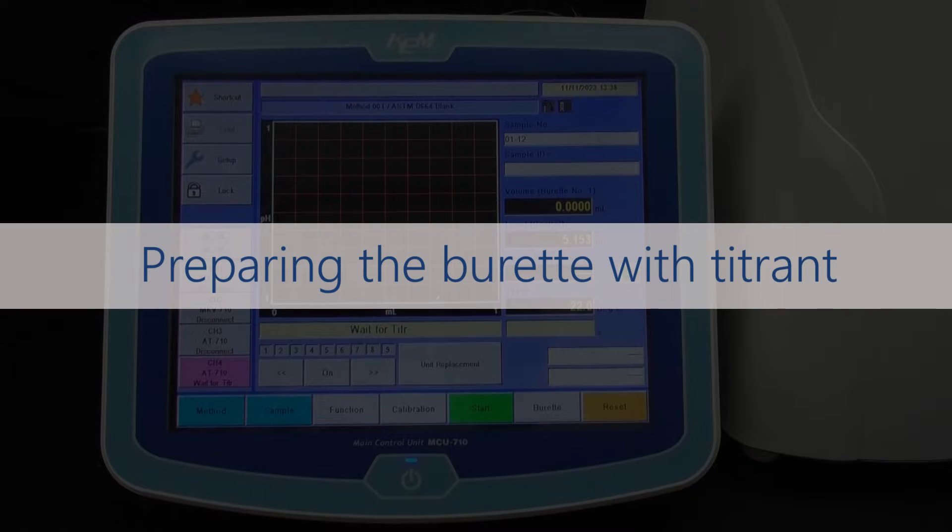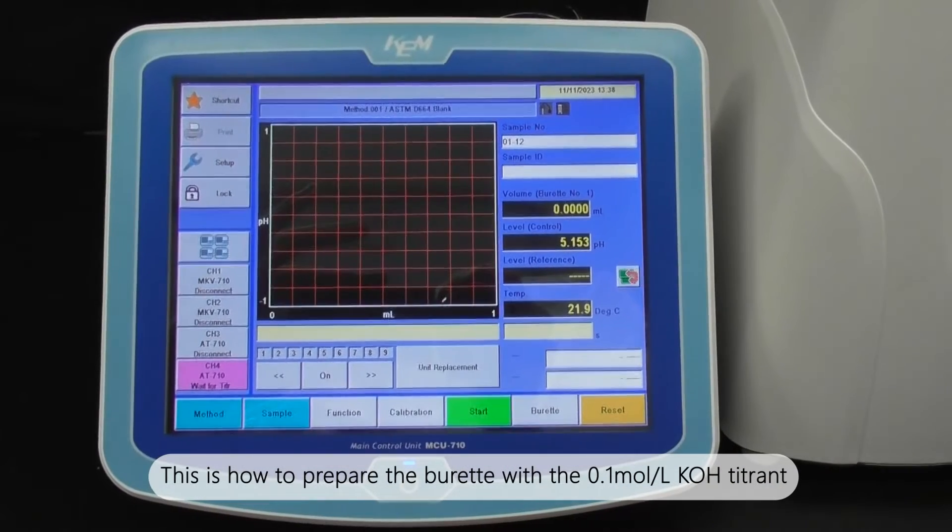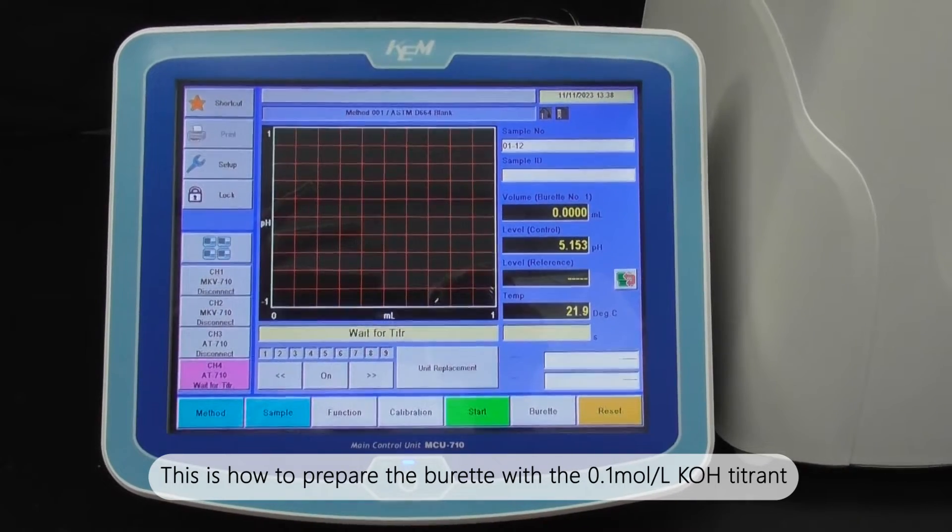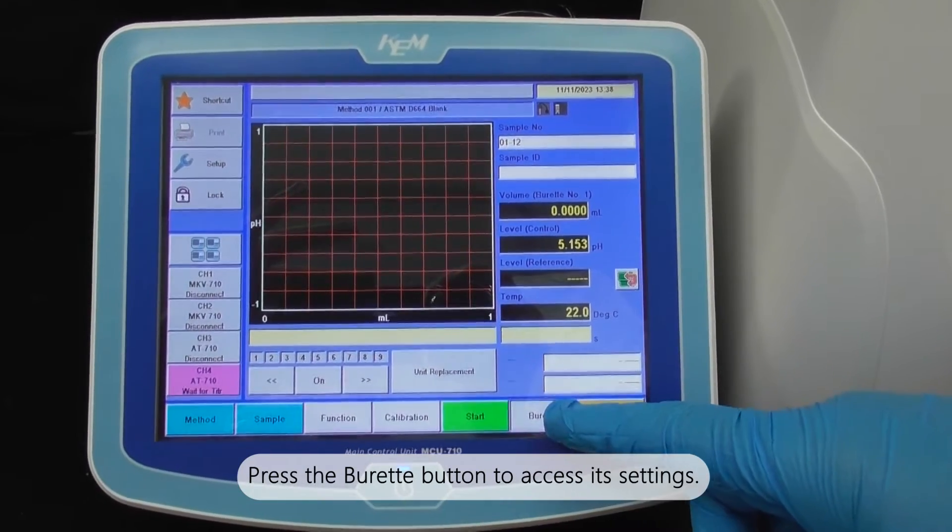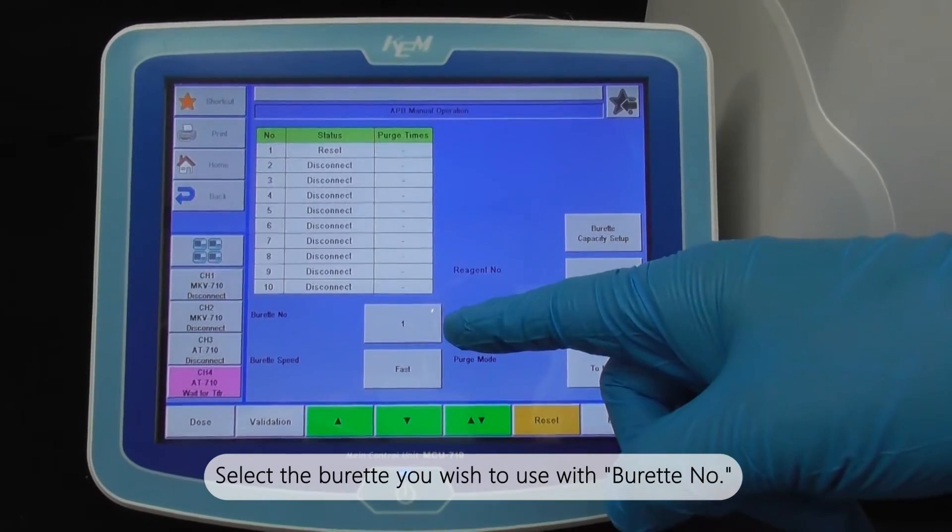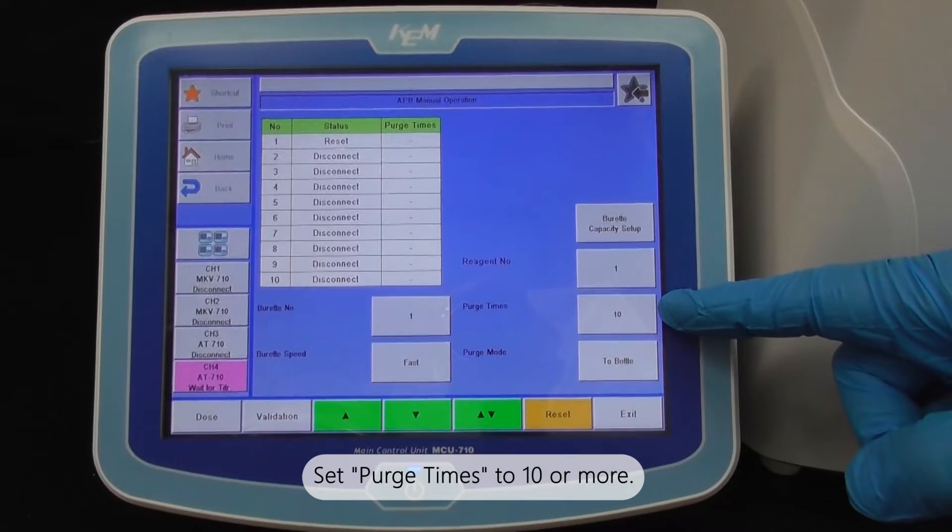Preparing the burette with titrant: This is how to prepare the burette with the 0.1 mol per liter potassium hydroxide titrant. Press the burette button to access the settings. Select the burette you wish to use with burette number. Set purge times to 10 or more.